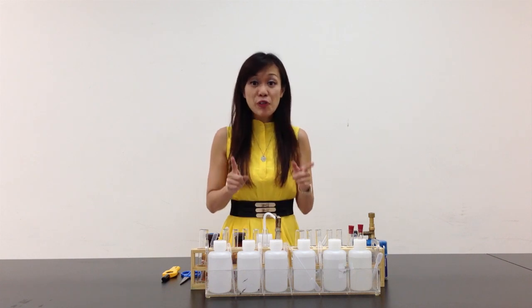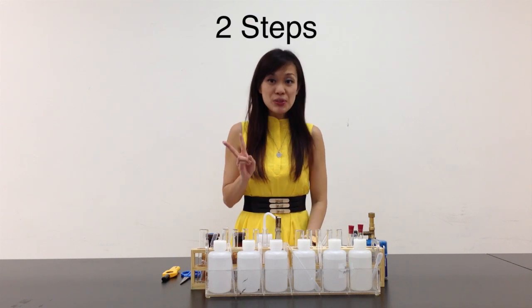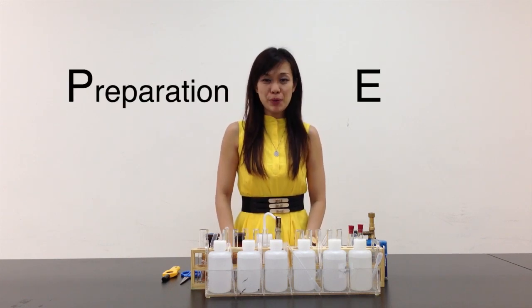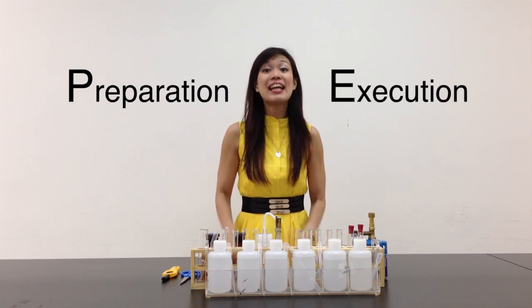But as I always say, do not fret. When you're doing practical exams, what must you remember? The basic two steps — I call it the PE. P stands for Preparation and E stands for Execution. Are you ready? Let's start preparing.